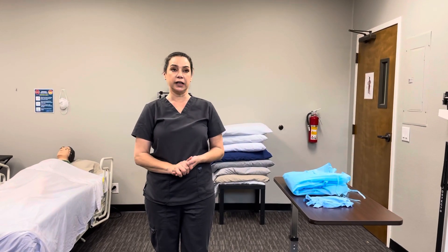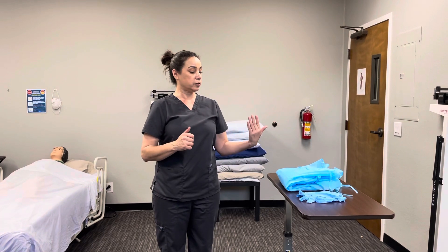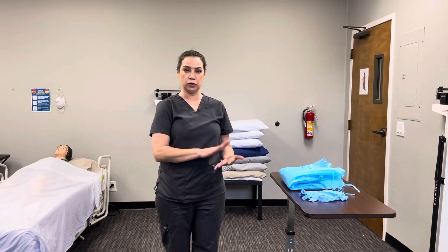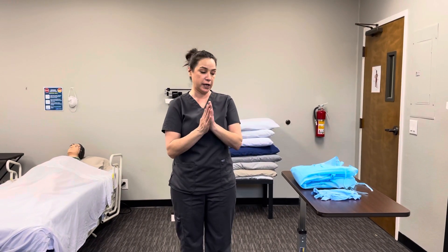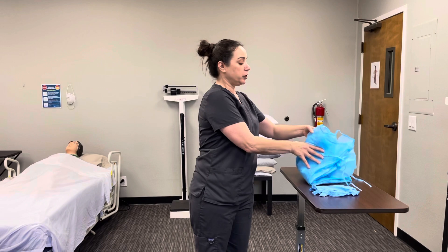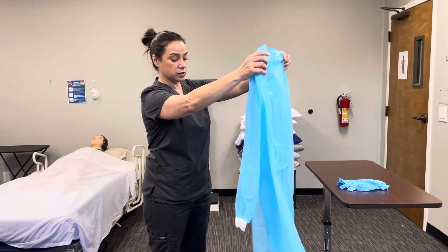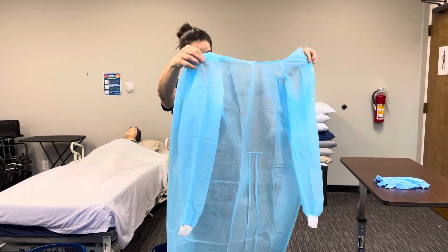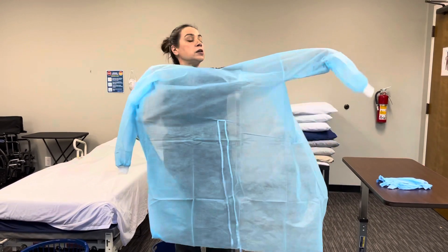Skill number eight: donning and removing PPE. The supplies you'll need are a gown and a pair of gloves, which will be provided for you. We'll begin by washing our hands. We're going to open up our gown without shaking, making sure we don't touch the floor, and we're going to look for any tears. Looks good.